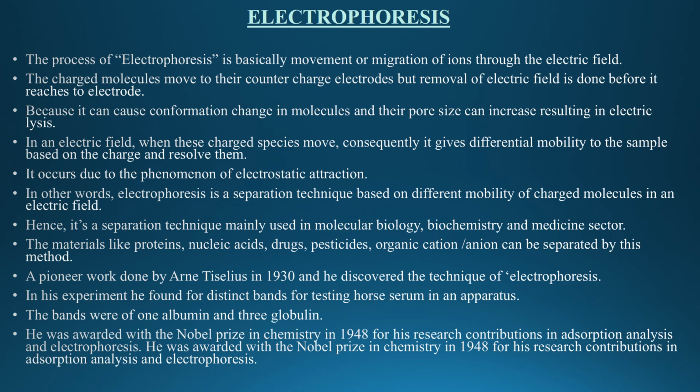Hence, it's a separation technique mainly used in molecular biology, biochemistry, and the medicine sector. Materials like proteins, nucleic acids, drugs, pesticides, and organic cations or anions can be separated by this method.